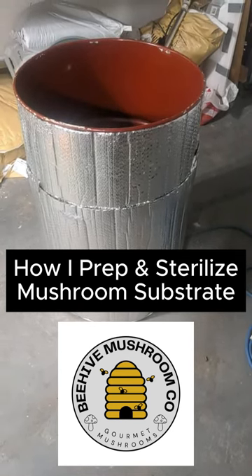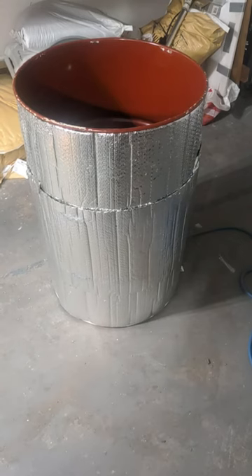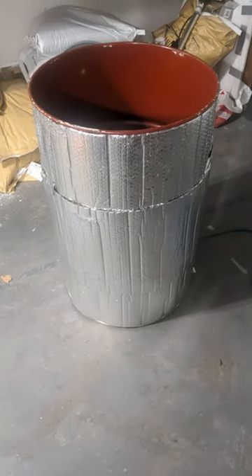Hey everyone! Michael from Beehive Mushroom Co. here. Just want to show you my steam sterilizer setup and how I prepare fruiting blocks.